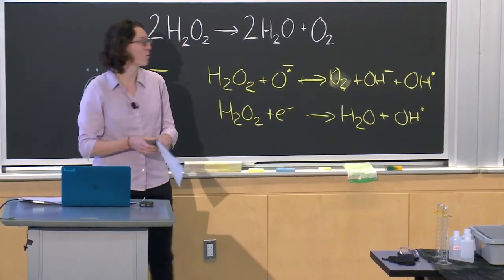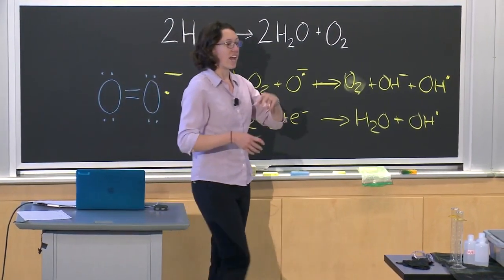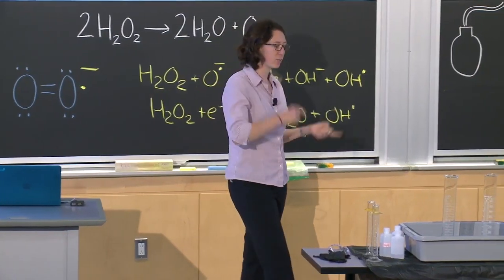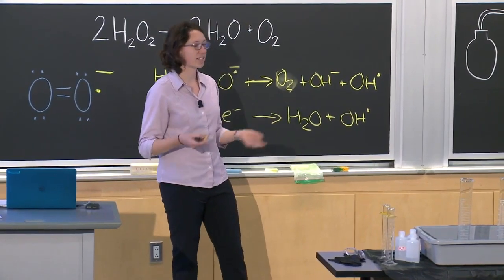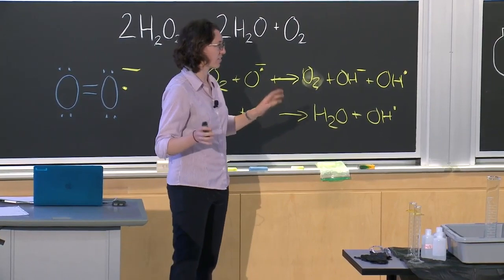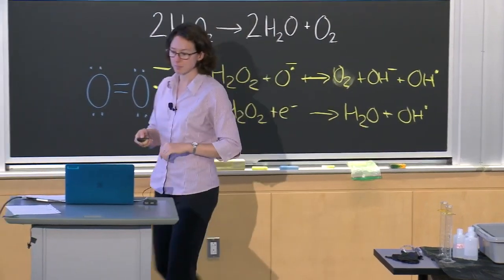So we need a way to get rid of the hydrogen peroxide in our body, and that is what catalase is for. And all organisms have catalase. You can extract it out of humans, all types of mammals, even plants have it. Cells do not want hydrogen peroxide in them, so there are different forms of catalase that you can get from any organism, bacteria, all the things. The catalase that we're going to be using in the lab was extracted from cows, so just a fun fact.